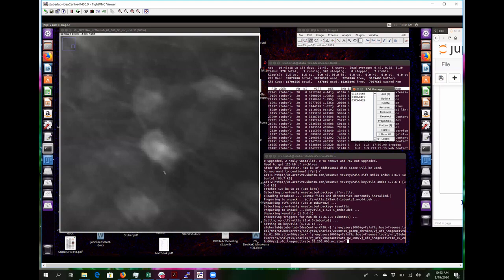And there's actually a tiny maybe thing sticking out here. I think there's a process sticking in the middle of that other ROI. But I think it quickly goes out of frame, because otherwise you would see a bright spot here. I'm not 100% certain about any process going this way, so you can kind of see something going this way.